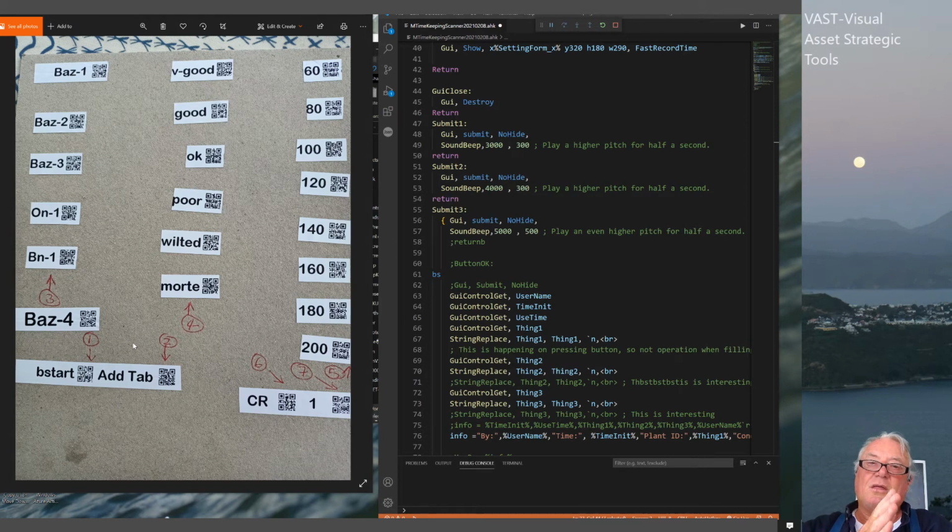So from the initial idea and the scanner and doing it and then processing it, the next step is this. This is too remote. So 2 things you could do at this point is take the tablet itself, put the dongle onto the tablet, and take the tablet close by. You don't need to look at it, you just need it in close proximity to be able to go through a very big greenhouse and scan a whole lot of plants.